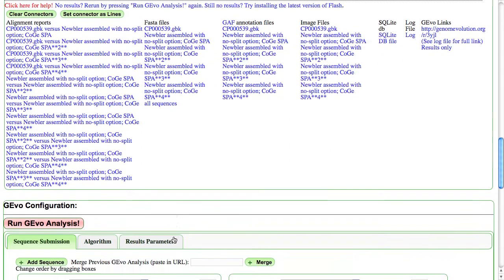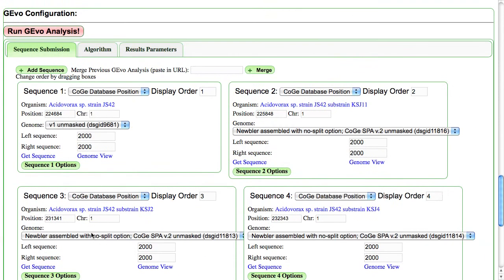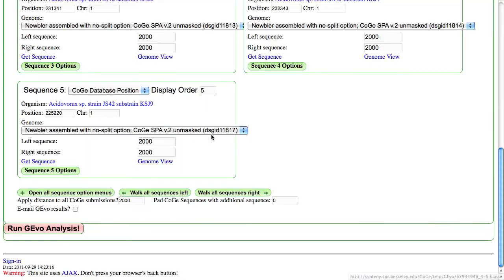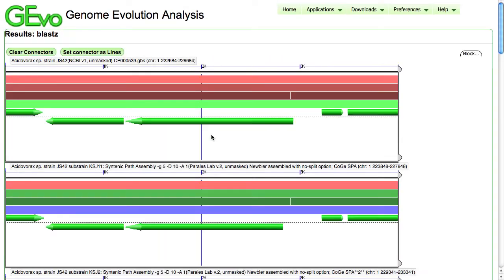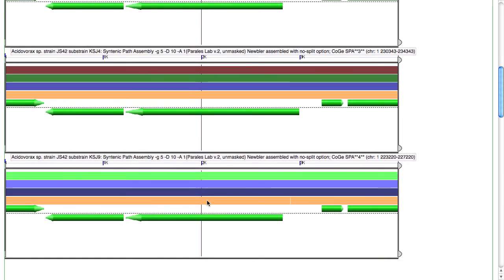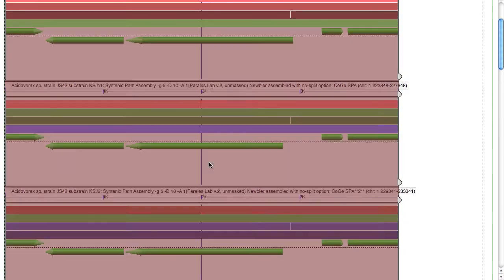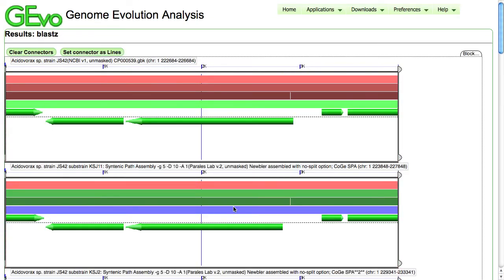decent and putatively real. So I can expand this search by looking at 2,000 nucleotides upstream and downstream of that position and see if there's anything nearby. And as I scan through, I don't see anything anomalous, and I can just click these regions just to see if there's anything that might jump out. So as far as a polymorphism goes, there's nothing that I see within the assembly or within these alignments that may suggest something is wrong with it.